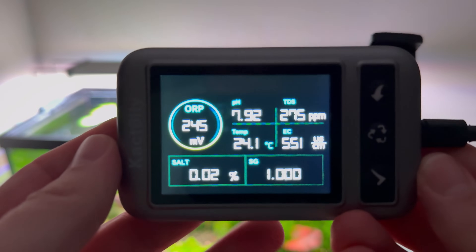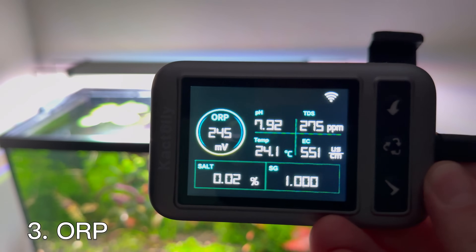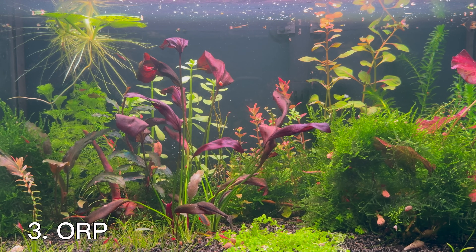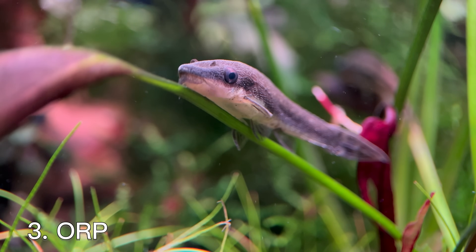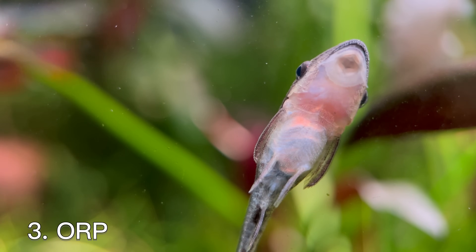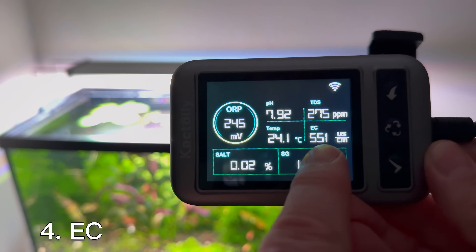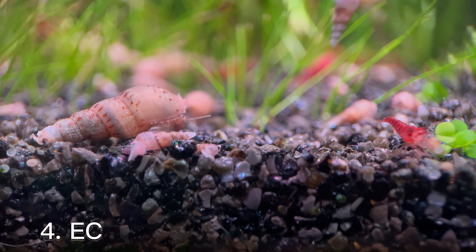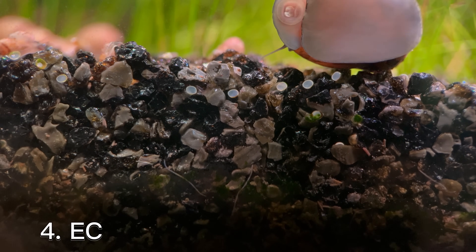The next thing this device measures is oxidation reduction potential, or ORP. It is determined by the oxidation and reduction processes taking place in the water. It is ideal to keep the ORP value of the fish tank between 200 and 400 to ensure equilibrium between oxidation and reduction reactions, and it promotes the healthy growth of fish by controlling oxides and organic substances in the water. Electrical conductivity, or EC, in a fish tank measures the water's ability to conduct an electrical current, which is directly related to the concentration of dissolved ions and solids like calcium, magnesium, and other minerals.